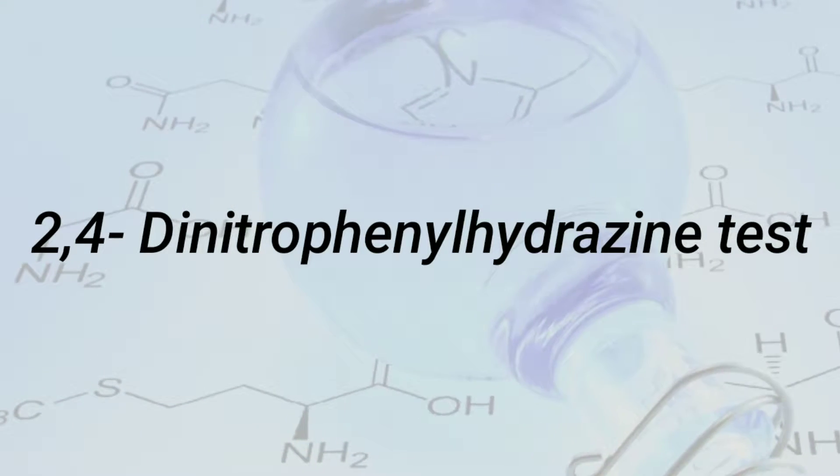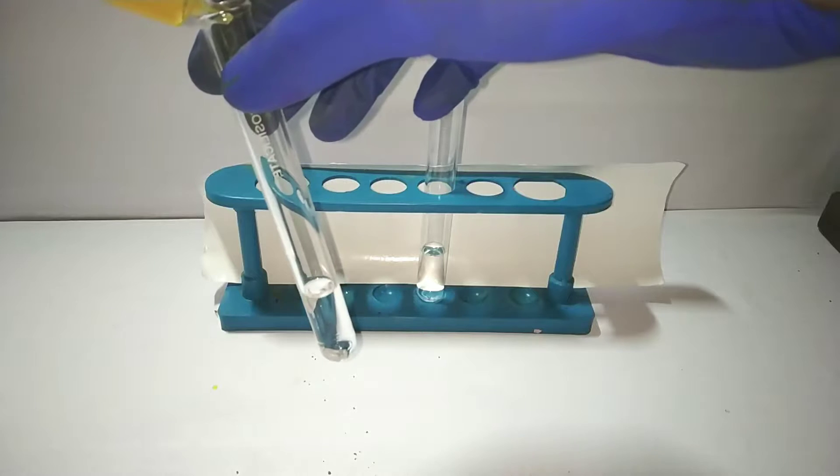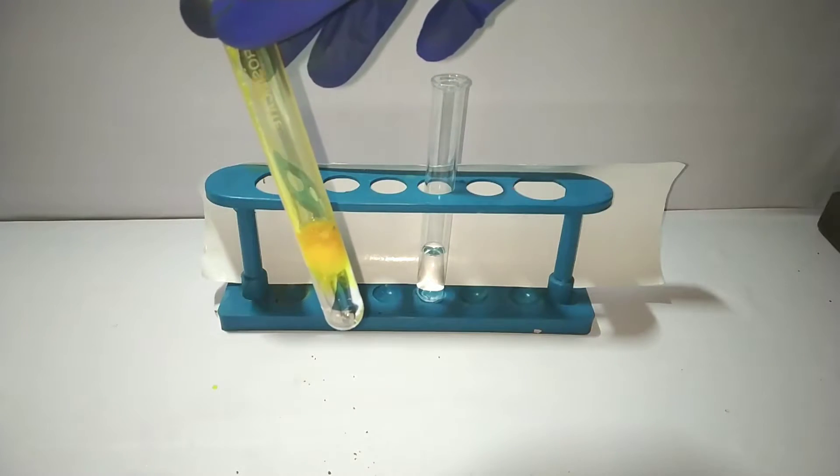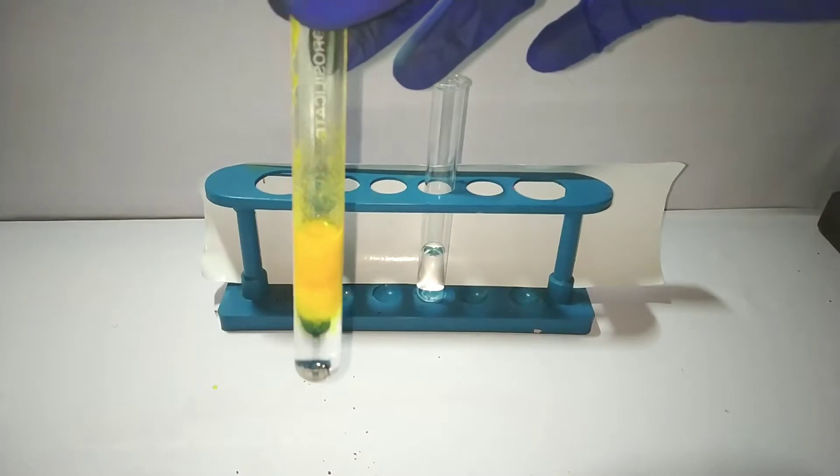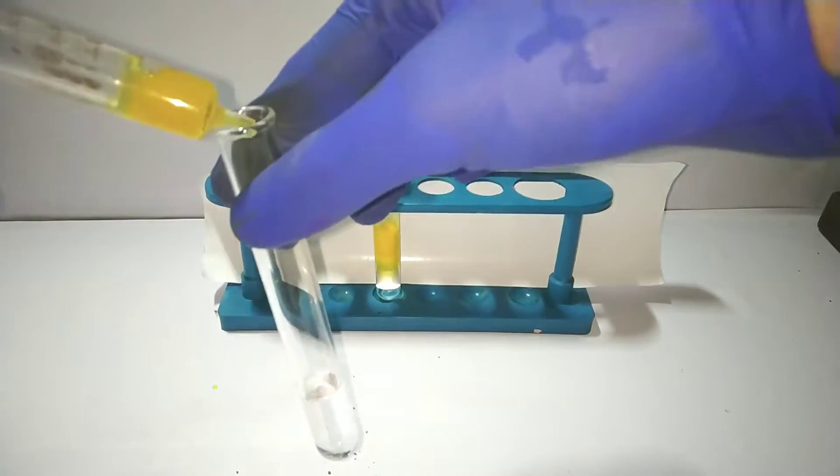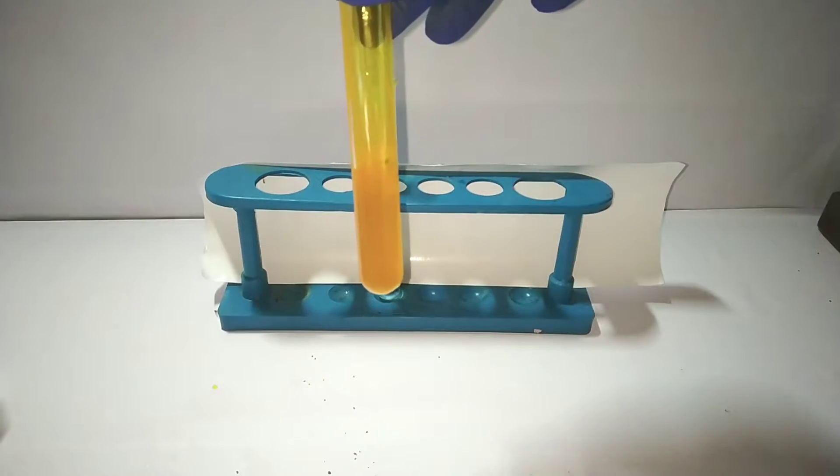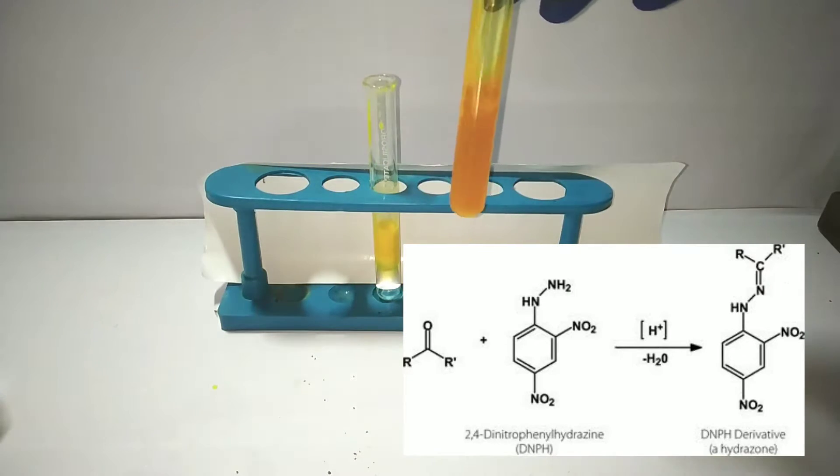Let us begin with the 2,4-dinitrophenylhydrazine test. This is a general test given by both aldehydes and ketones. Here I have an aldehyde and a ketone sample in two test tubes. Into the sample I add about 1 to 2 milliliters of 2,4-dinitrophenylhydrazine reagent solution. Immediately on adding the reagent you see a yellow colored precipitate that has formed. You have a similar result when you add the reagent to the ketone solution. In the second reaction we got an orange colored precipitate.